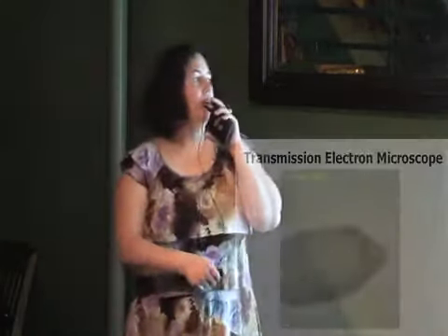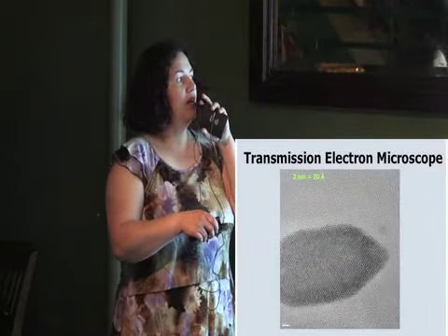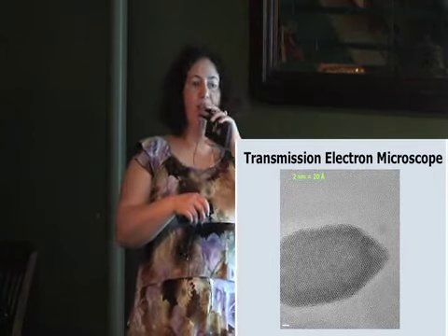And here it will be with a much higher magnification. I'm now talking about 2 nanometers, 20 angstroms. If you reduce this by 20, 1 angstrom is the size of an atom. So what you're observing here is basically an arrangement of atoms in a certain material. The black dots are the representation of the atoms.